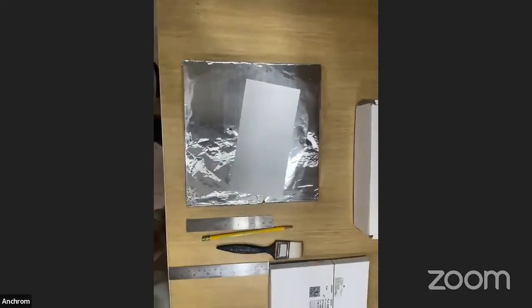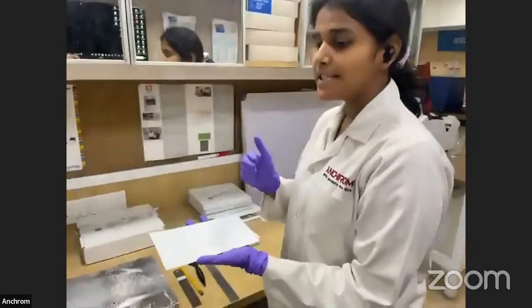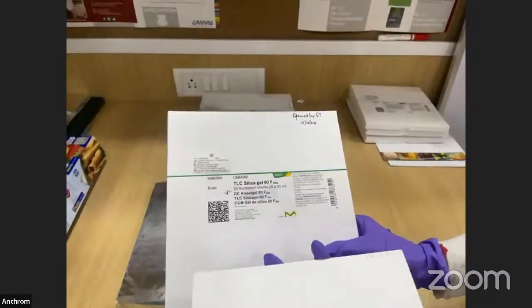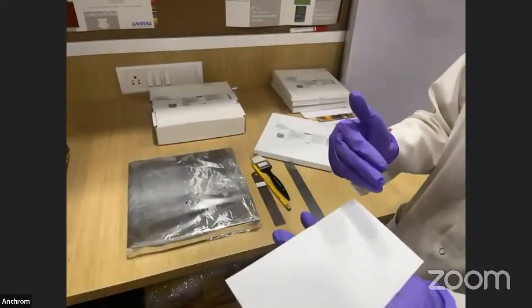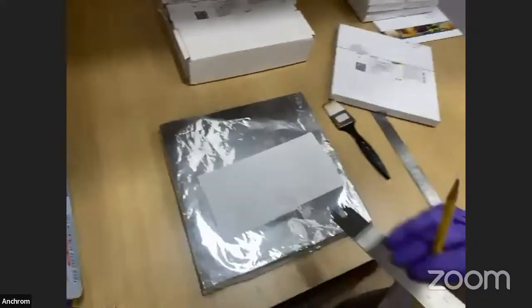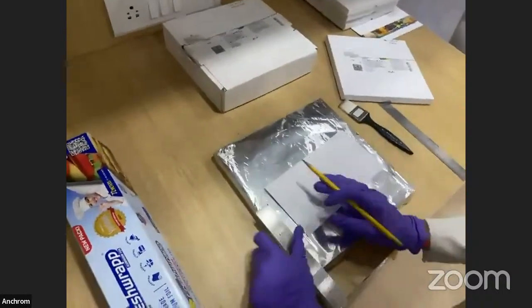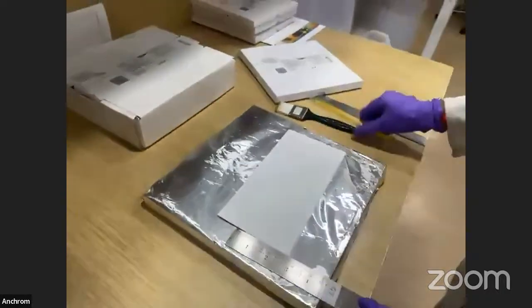Sorry for the delay. We were facing some technical issues. As I've mentioned, our samples are kept ready. Now we'll select the stationary phase. This is the TLC silica gel 60 F254 stationary phase. Onto this stationary phase, we will apply our samples. We'll mark the stationary phase at 70 mm, so that we develop our plate up to 70 mm.